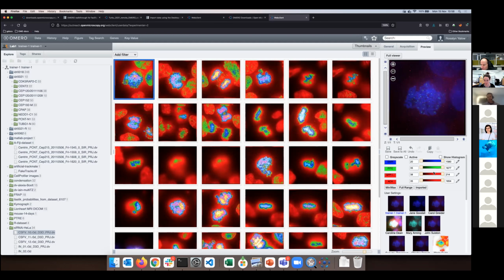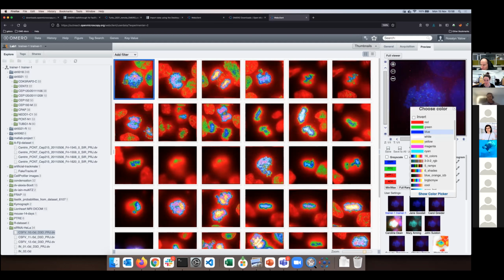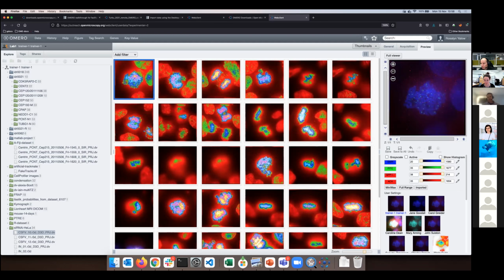So I clicked on the pencil icon. We support all the LUTs, lookup tables, which ImageJ supports, and then I can say save, and this will change the icon here. So the thumbnail and the new rendering settings will be saved on the server, like so. Okay, so this is the simplest manipulation. I can change the display. Again, nothing of that changes the original file. You can think about the rendering settings as a pair of goggles with which I'm viewing the images.